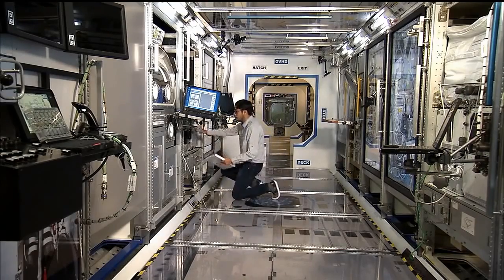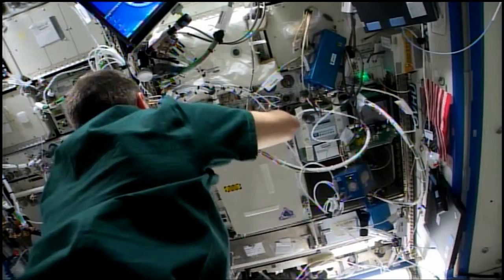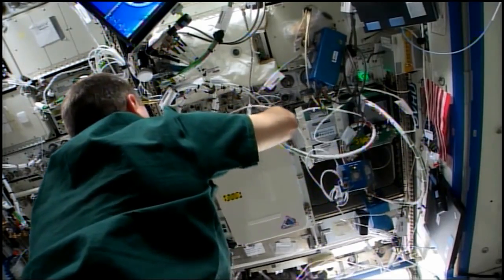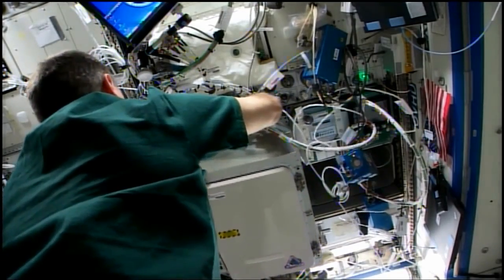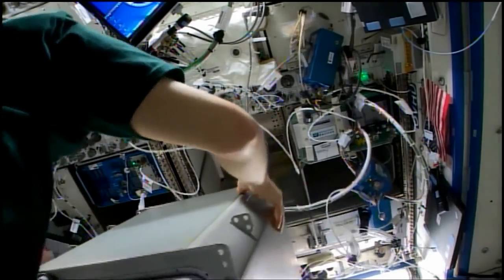Okay, yes, GLACIER came back on the SpaceX Dragon with some samples, and so this facility is a freezer, and the capability is from +4 all the way down to -160 cryogenic freezing. And so just as a point of reference, your refrigerator is around +2, and your freezer at home would be -18. And so experimenters use this to preserve and to transport the samples that they take on orbit so that they can bring them back down to Earth, and the scientists can process them. And so we can get the science from what the experiments have done on orbit. So it's very important for us to have this facility here and to train our ground controllers so that they're familiar with the activities and so they can support the crew once they're on orbit running the activities.